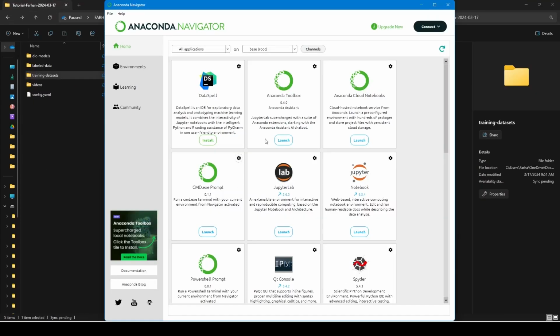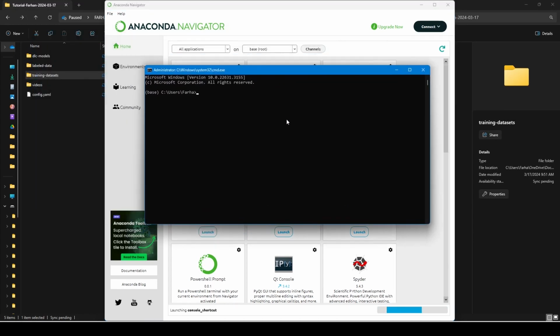Right, so all of the video frames have labels, and the skeletons are showing up as I expected. Alright, after creating your labeled frames for training and double checking them, let's go ahead and open up our DeepLabCut again.